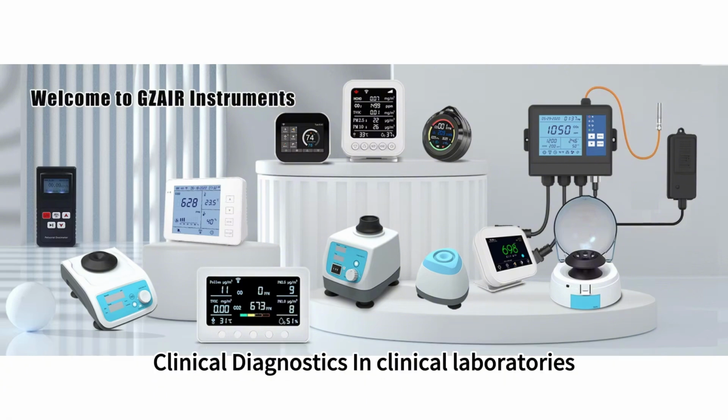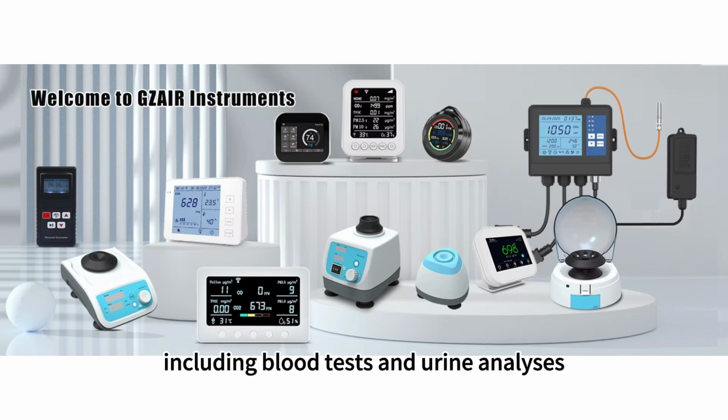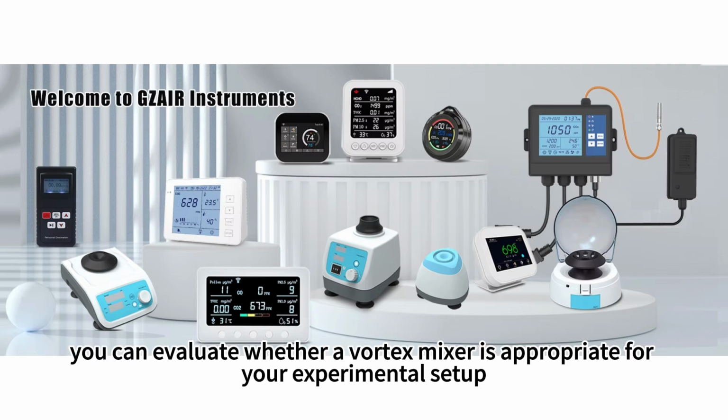Clinical diagnostics. In clinical laboratories, vortex mixers are used to prepare samples for diagnostic tests, including blood tests and urine analyses. By understanding these typical applications, you can evaluate whether a vortex mixer is appropriate for your experimental setup.